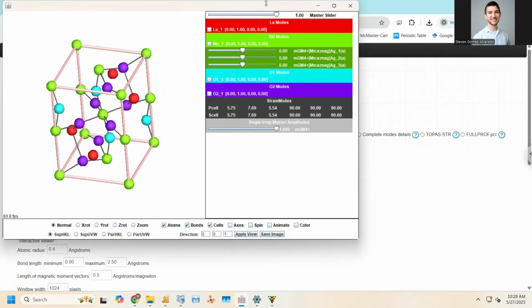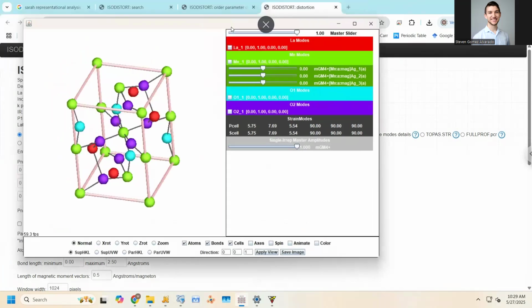Okay, that's a good question though. It's worth testing. People have different approaches with this. I've heard conflicting things. If you do have three degenerate modes, some people say you should just refine one, but I don't really think it matters.